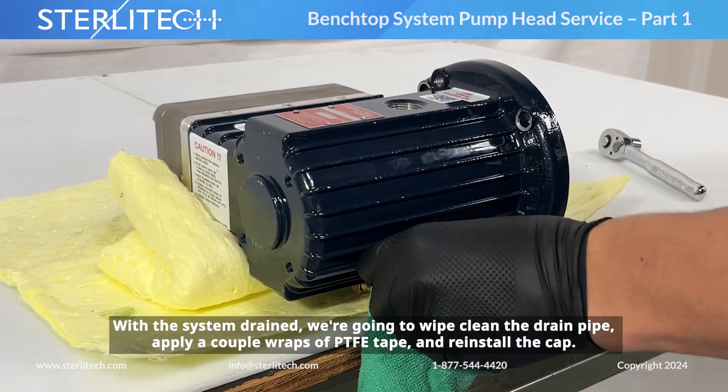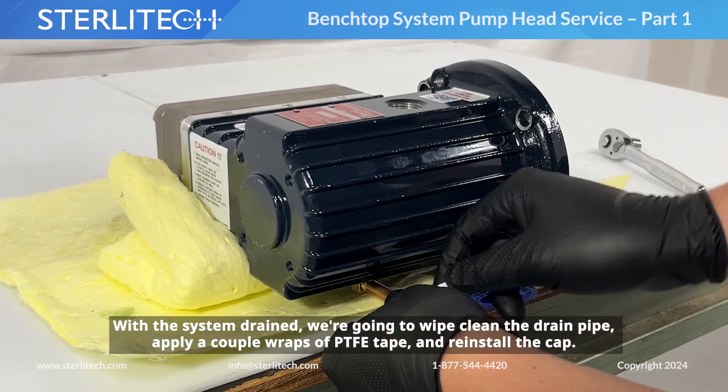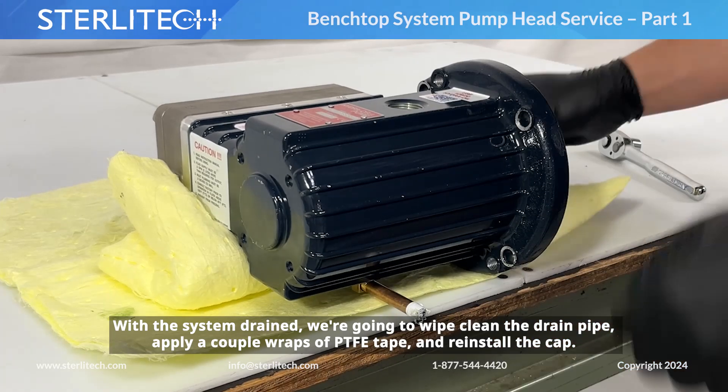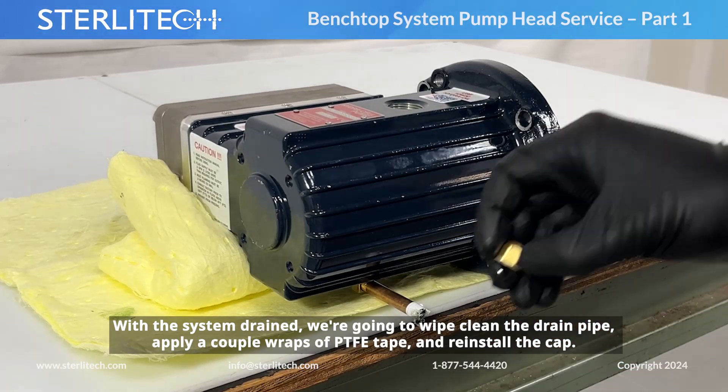With the system drained, we're going to wipe clean our drain pipe, apply a couple of wraps of PTFE tape, and reinstall our cap.